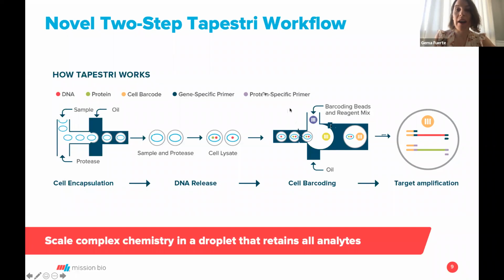That is called barcoding, where you combine a single cell lysate with a bead with a unique barcode, and all the primers specific to your assay, because it is a targeted approach. So at the end of day one, you generate nano PCR reactors where you have the genomic DNA of a single cell with a unique barcode and all the primers required to perform downstream amplification.